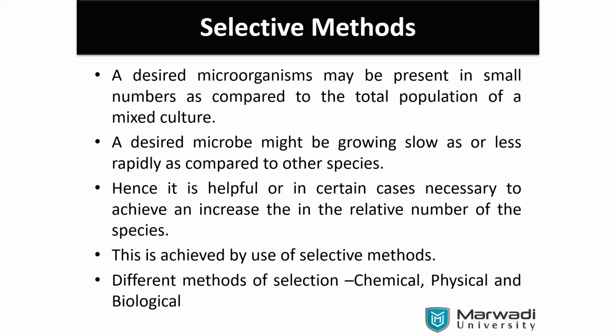If it is not there, that means you have taken the fungus spore with you. Then you are rubbing here and there. It is gifting and lifting. Whenever you touch or shake hands, you are gifting them, sharing with them that I do have some fungus. It is normal. After doing some microbial work, you may get noticed. Otherwise, you will do the same practices day by day. That is why it is advisable to wear a mask and others, but it is up to a limit for us.